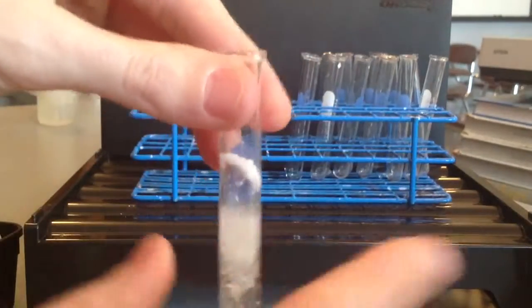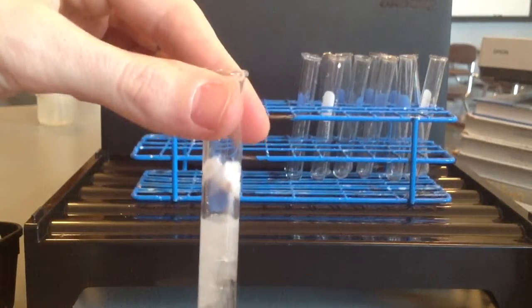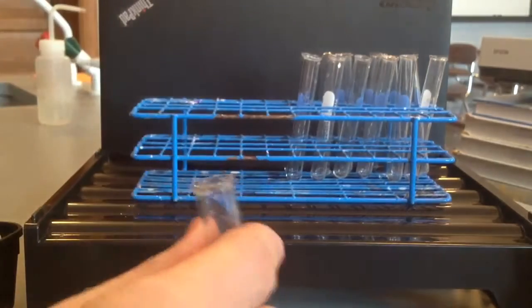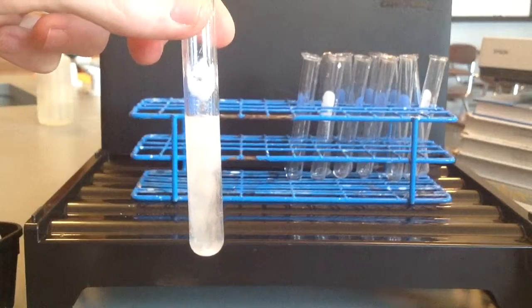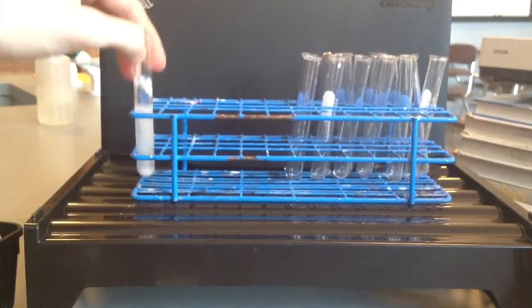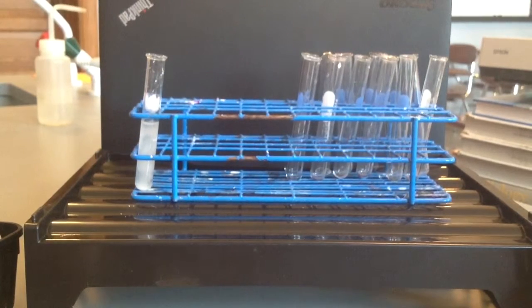It's kind of stuck. You might even actually be able to hear it. Alright, I'm going to put that right back there. So that is the sulfuric acid and calcium carbonate. This would be the part where you record your observations of everything you saw from when they were mixed together. I'm going to wait about 10 seconds and then I'm going to do the burning wooden splint test.